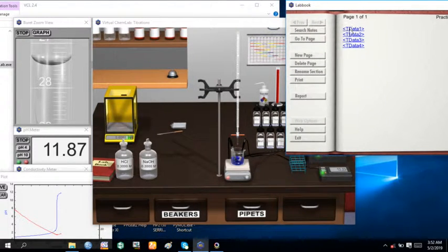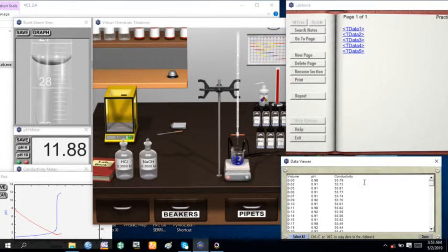These are already some results on different types of experiments that we have already conducted in acid-base titration in the lab book. Now, if you click the stop clock, if you now click on the save button, a blue data will be recorded on the workbook, and this is data 5. If you double click it, it will show you the result of our titration. This is the first experimental result.